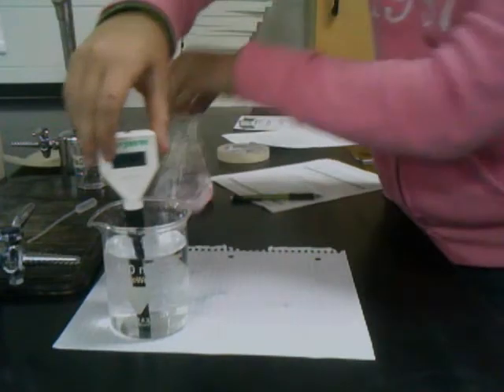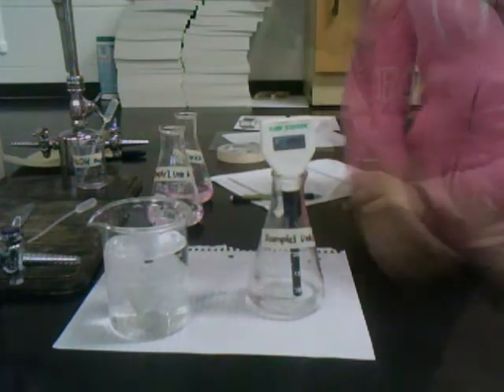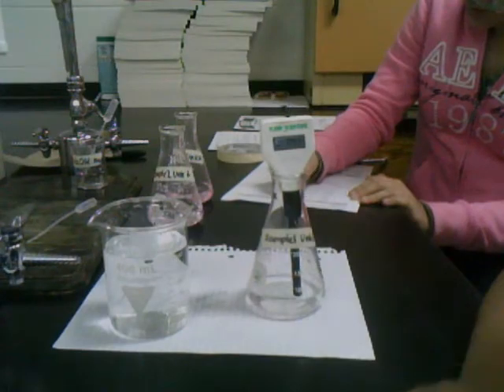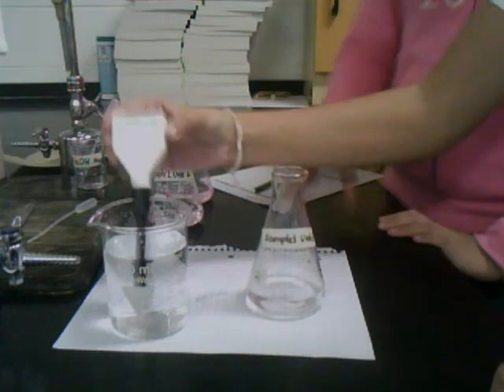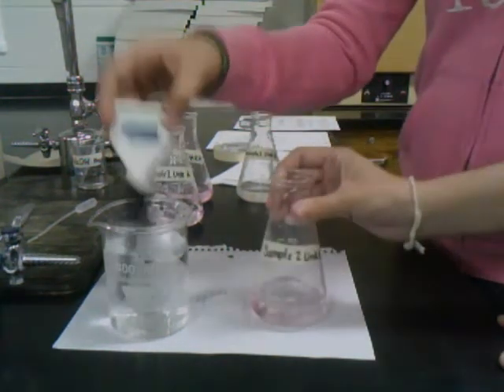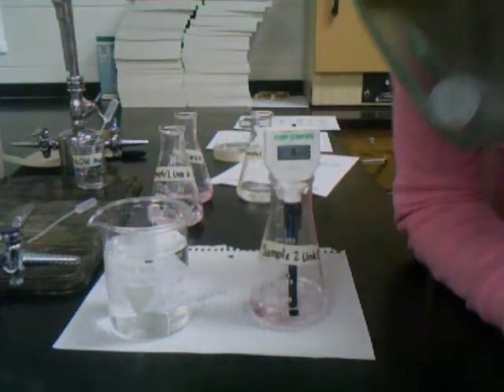We'll find the pH of sample 1 of unknown E next. The pH has settled on 8.62. We'll rinse this again and move on to unknown E sample 2. The pH of this one has settled on 8.45.